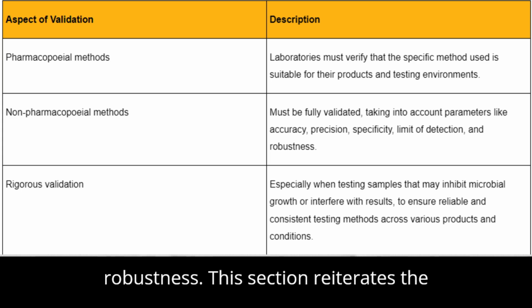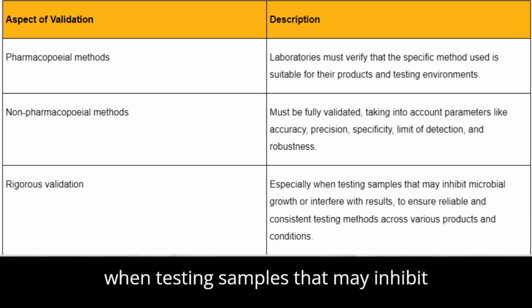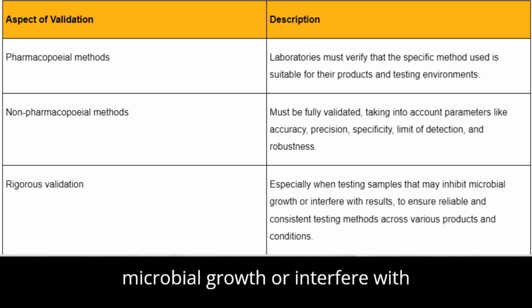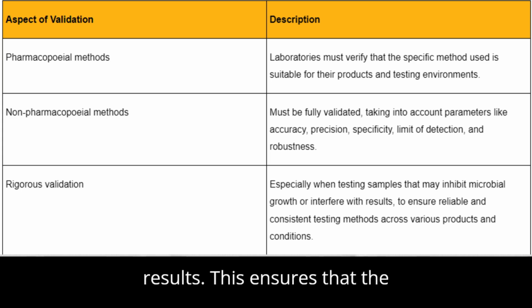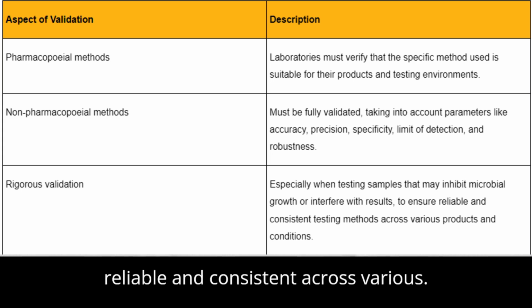This section reiterates the need for rigorous validation, especially when testing samples that may inhibit microbial growth or interfere with results. This ensures that the laboratory's testing methods are both reliable and consistent across various.